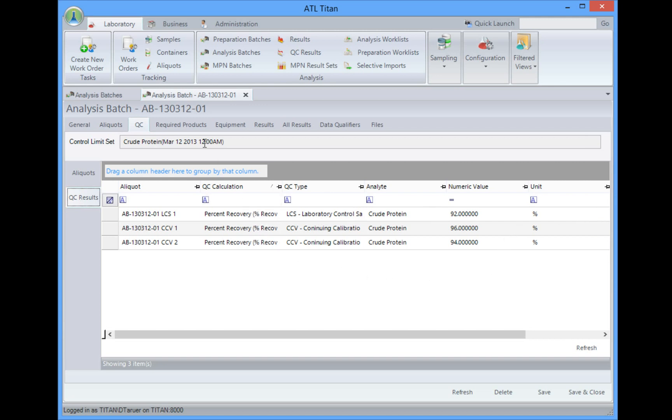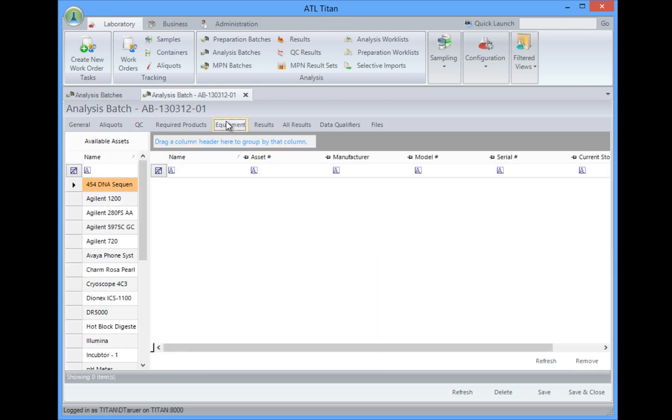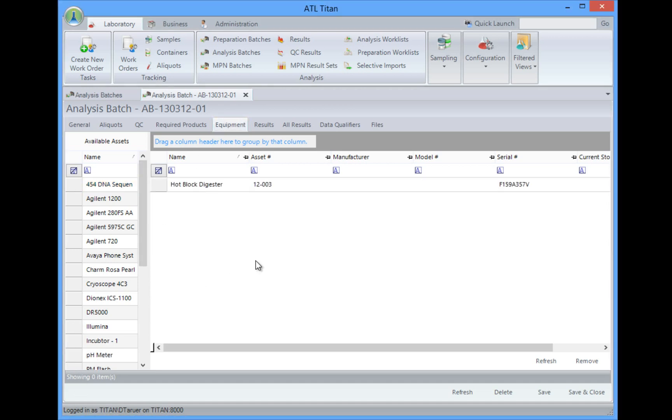We can assign products, so if we wanted to subtract inventory from our inventory when we do an analysis batch, we can do this by assigning products. We can even go in and assign other equipment. So not only can we actually identify the instrument that was used, but if anything was used as far as an incubator or a digester, we can just move that over, and now we can assign those assets to this batch as well.